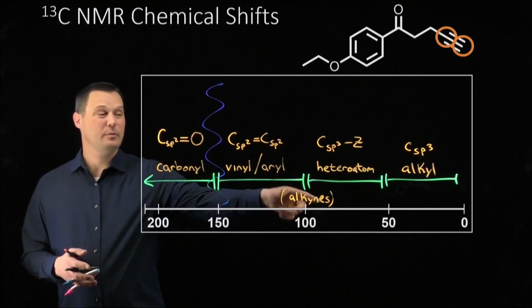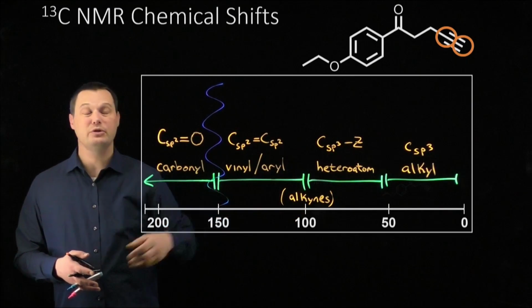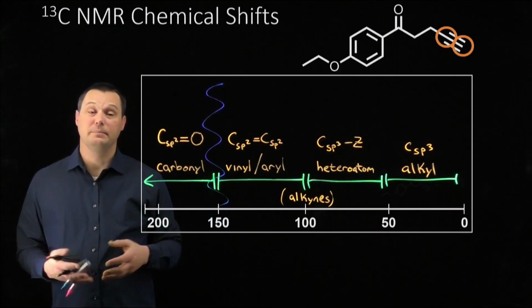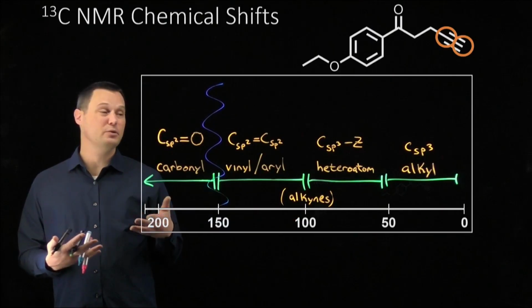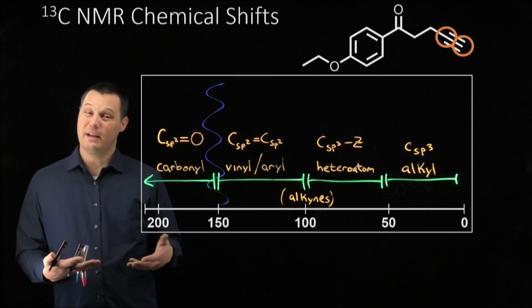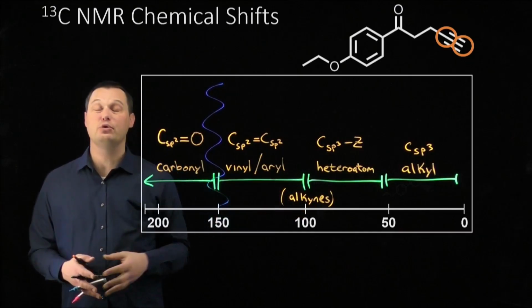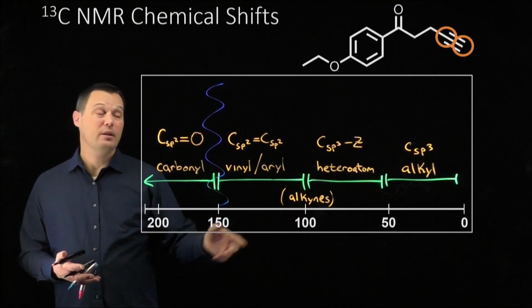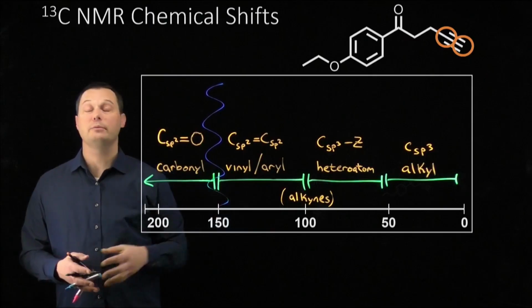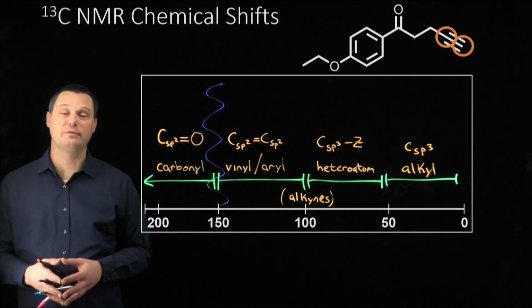We already have these chemical shifts accounted for in 2 other ranges. If you see signals in this region, how can you be sure they're not alkyne? You can't, really. But you should have enough other context clues from your other spectra to help you decide if it's an alkyne or not. We really don't see alkynes in spectroscopy land very often, so if you see a signal around here, I wouldn't assume alkynes as my first guess. I can look to the IR though. If there's really a triple bond in the molecule, the IR will let me know. These are the must-know chemical shift ranges for carbon NMR.